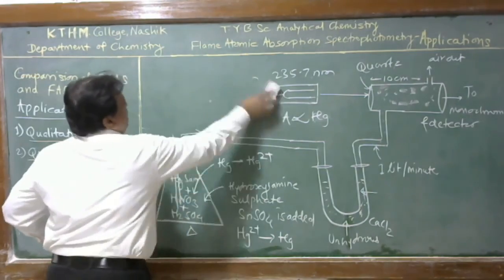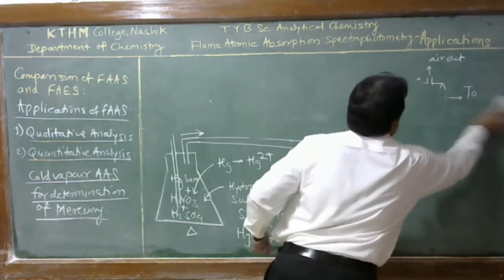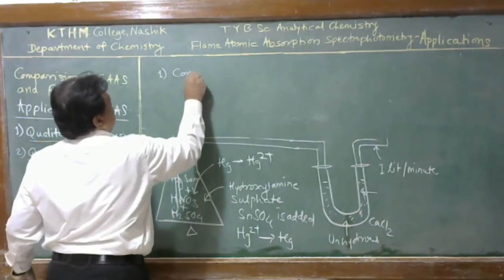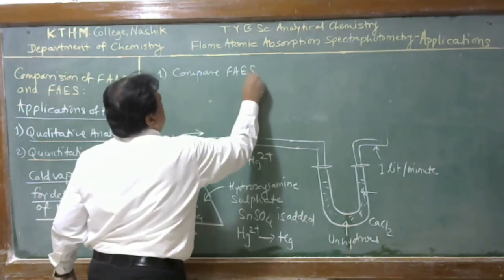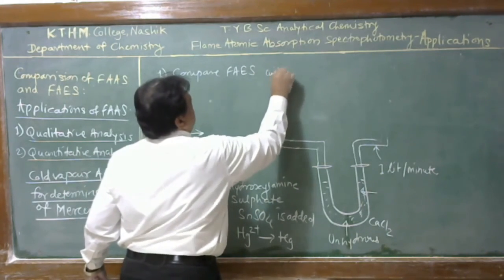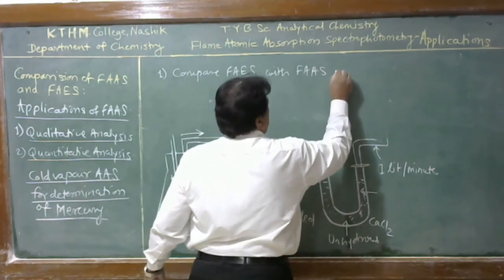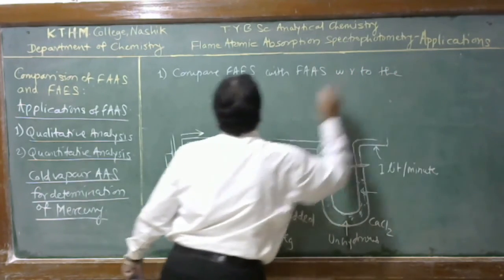With today's discussion, you can find out the answers of the following questions. Question number 1. Compare flame atomic emission spectroscopy with flame atomic absorption spectroscopy with respect to the different analytical parameters.